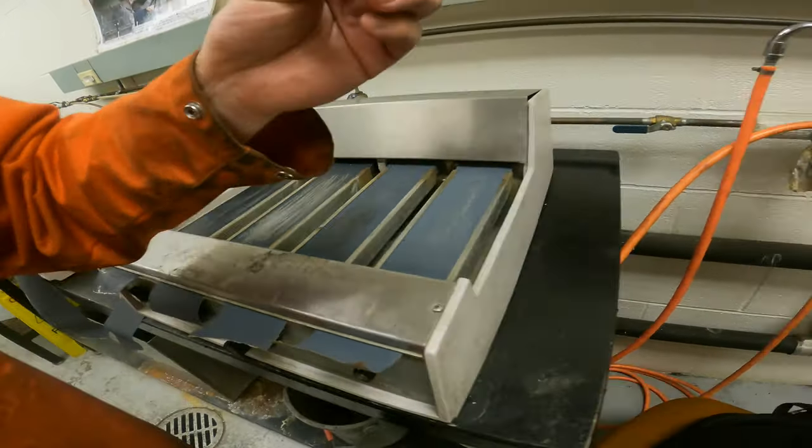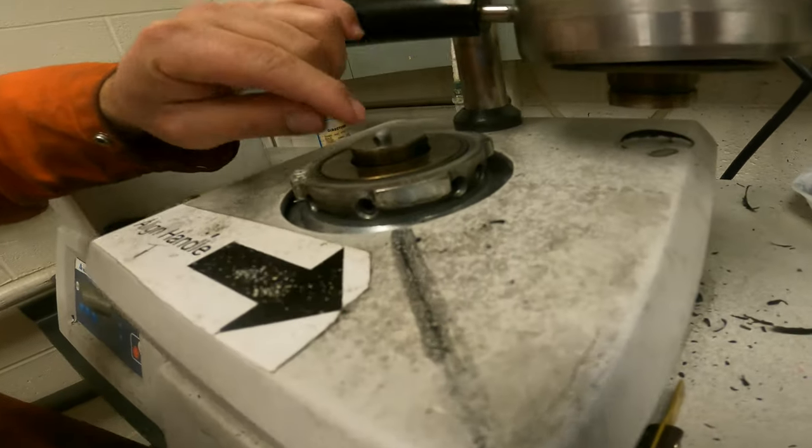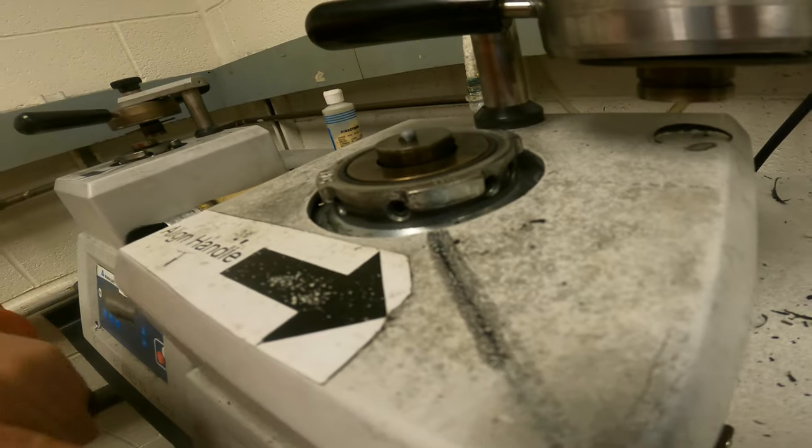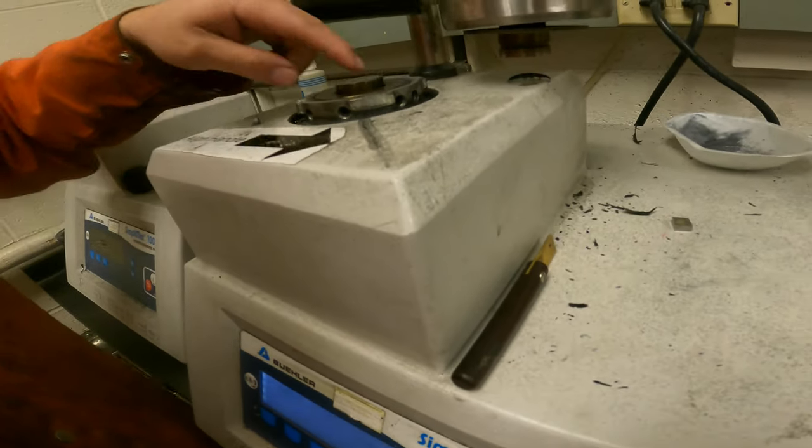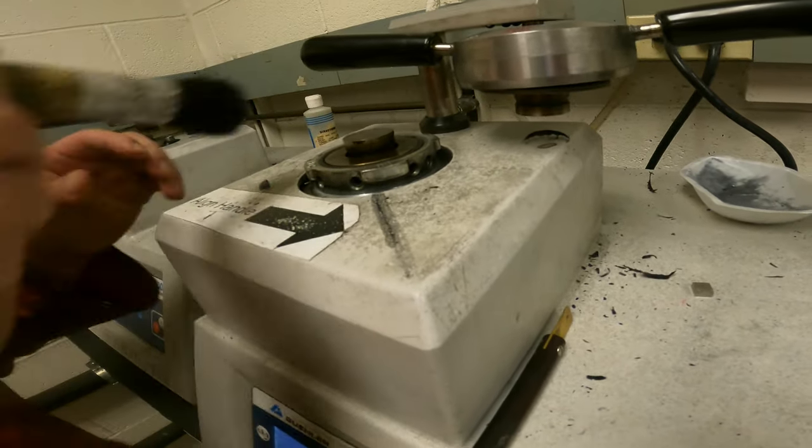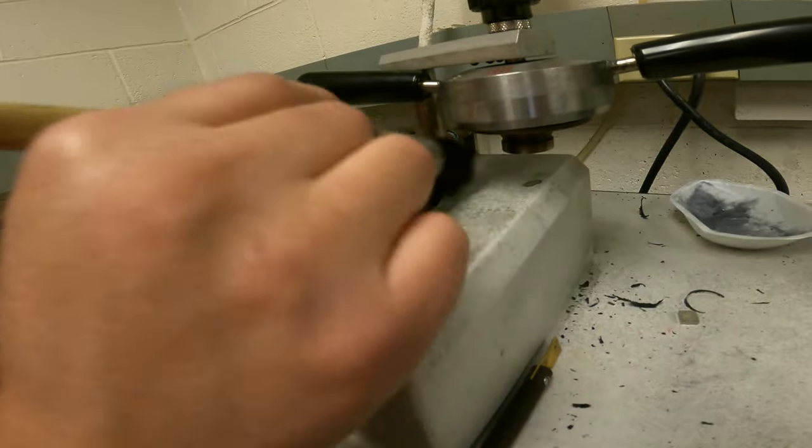After that, we set the sample with the surface that we want to polish down, touching the base, and we start lowering. Now, also important to remember, always make sure the machine is clean. When you're done, you need to clean the machine, but sometimes the machine is dirty, so make sure there aren't any of these plastic particles around.